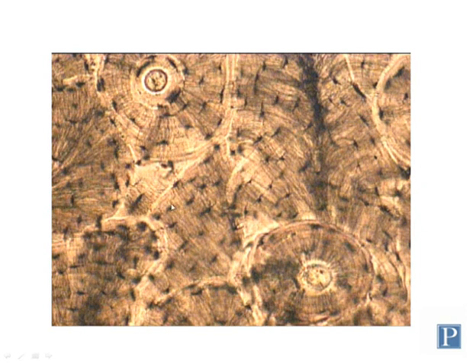Often they're kind of flat shaped or arch shaped, and they are found at various angles. These form as bone remodels over time, and the positions of the osteons change a little bit. And so in the interstitial spaces between the concentric lamellae, you have these odd-shaped interstitial lamellae.